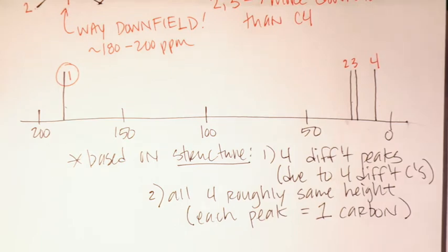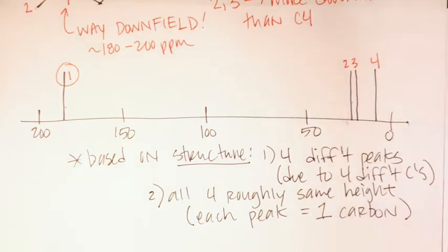Okay, and in our next example, we're going to see an example where the peak heights are different, and it's going to correlate with the number of carbons that it corresponds to. Okay, so I'm going to go on to the next example.